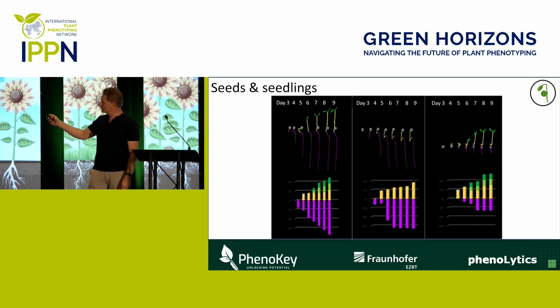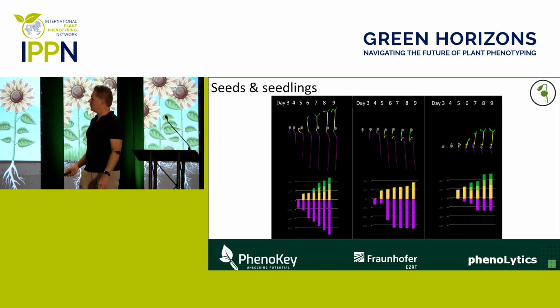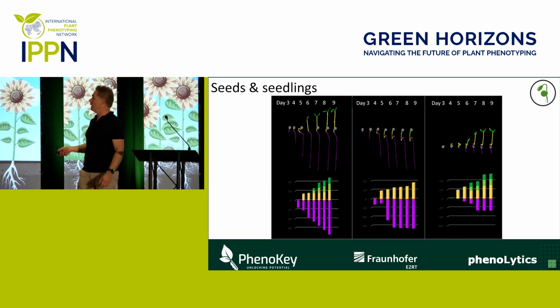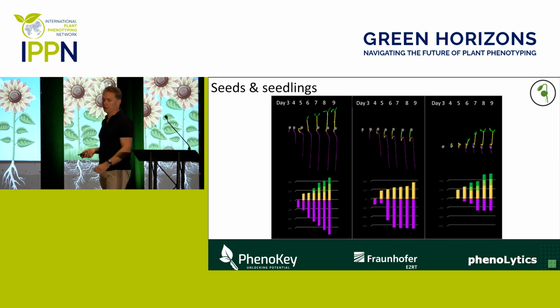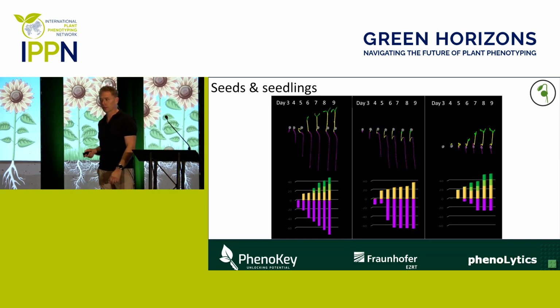Here you see time series. We follow a single seed over time, and you see the plants developing in 3 different seed lots. In the end, the germination count of these normal germination trials will result in the same germination observation. So they're all normals probably, and they're germinated. But you see that there is a completely different dynamic in how they germinate, and that can also be nicely quantified now on organ level, because the bars on the bottom represent the biomass per organ.